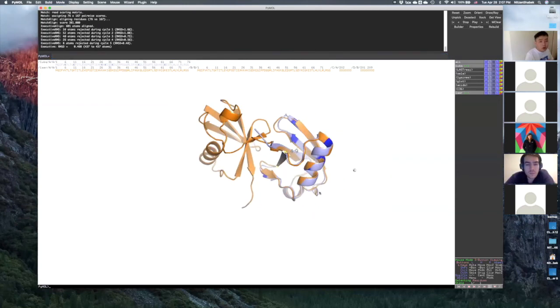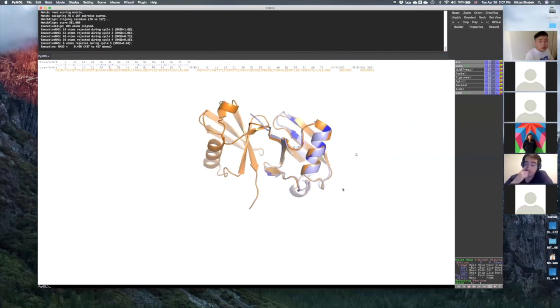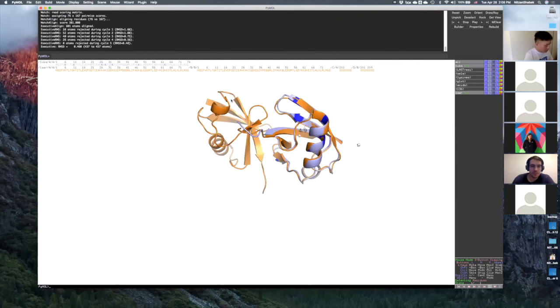Okay. Who got the alignment right? Me. No. Now we can analyze different features.